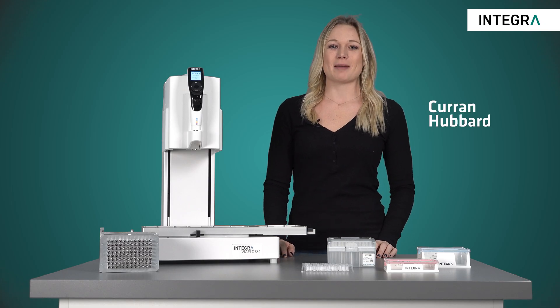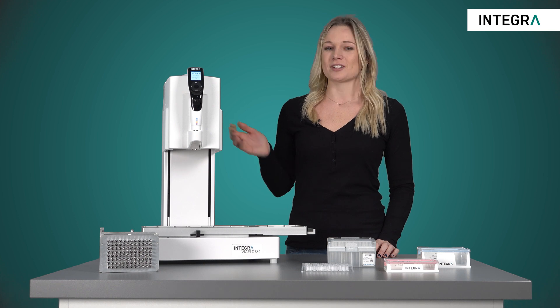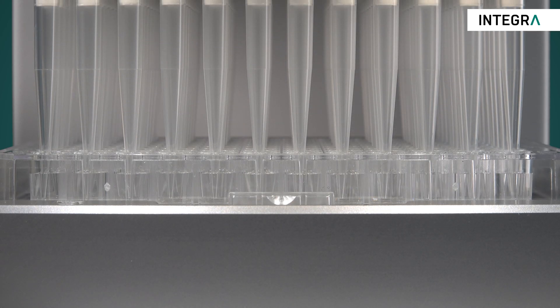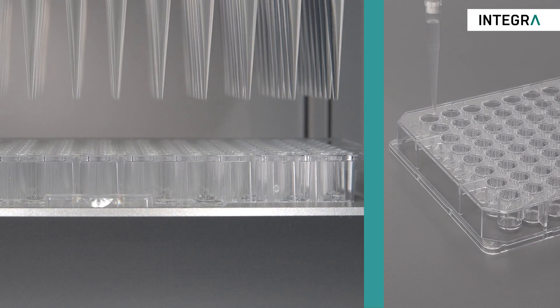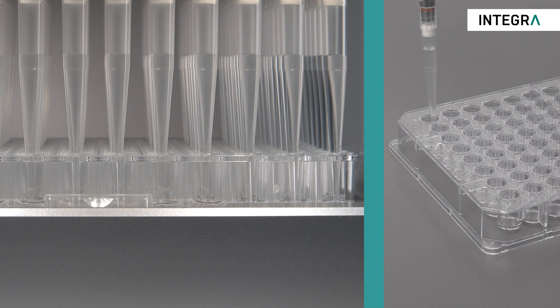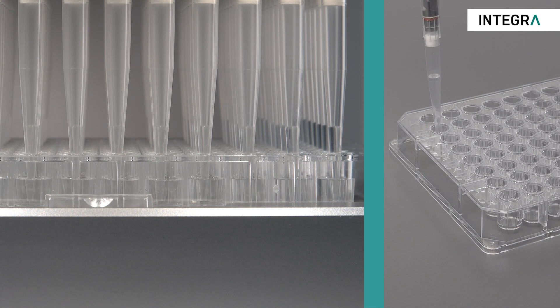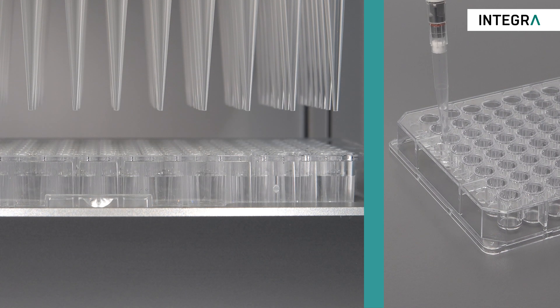Hey there! For the next few minutes I'm going to be showing you how running an ELISA assay can be vastly improved by using the ViaFlow 96 handheld electronic pipette. This 96 channel pipette makes the whole process faster, less error prone, and much more reproducible. The ELISA test consists of multiple pipetting steps, and the ViaFlow 96 channels make quick work of any multi-step protocol like ELISA, helping you complete this assay in a fraction of the time compared to traditional single or multi-channel pipettes.